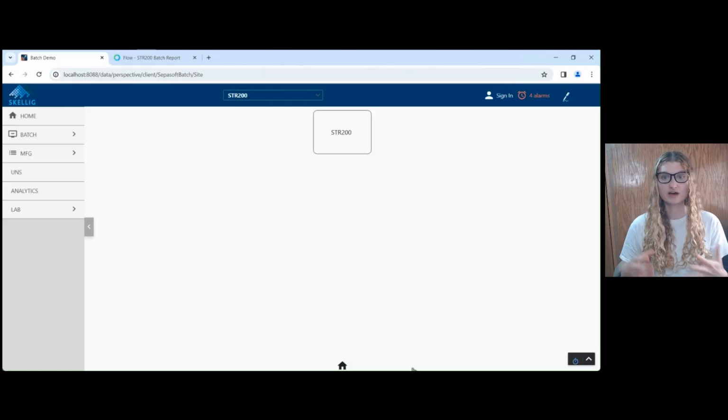That's going to lead to an increase in response time and massive cost savings for this facility, because we don't need to buy heavy-duty, expensive physical computer workstations for the plant floor. No, we're going to use GMP tablets. Now, speaking of the plant floor, let's take a look at it. This is the overview screen of our plant.